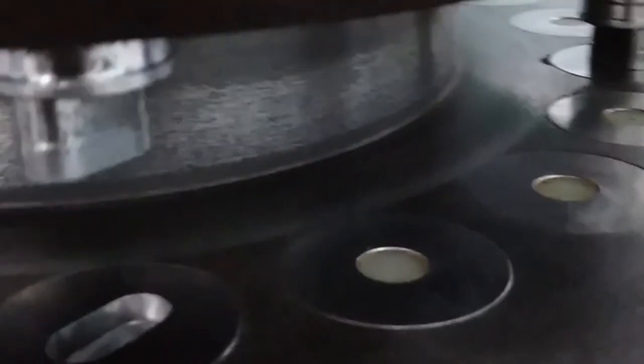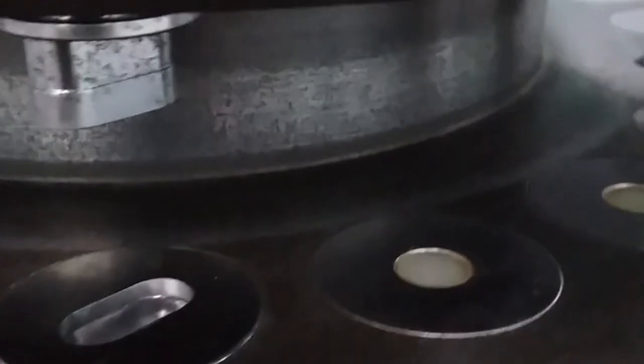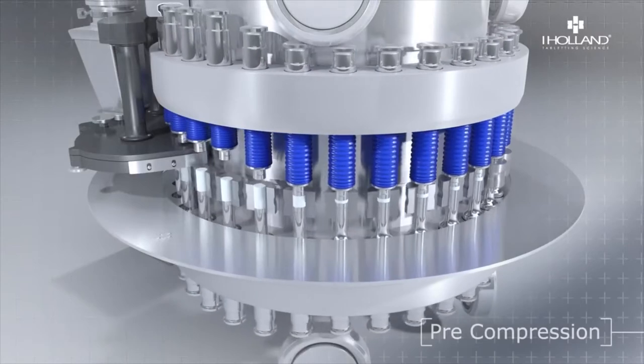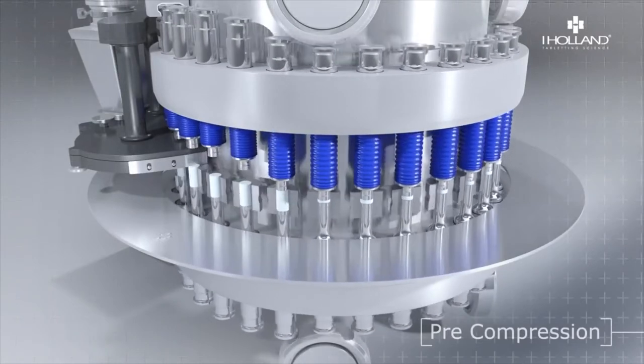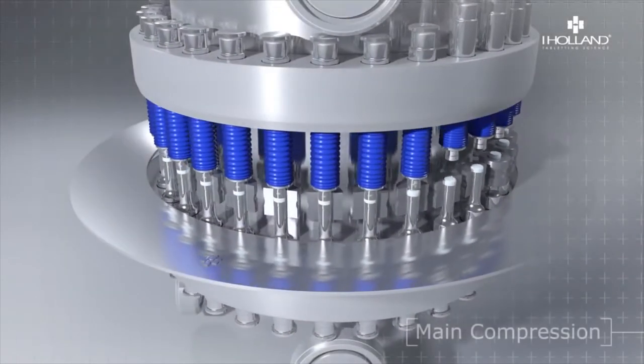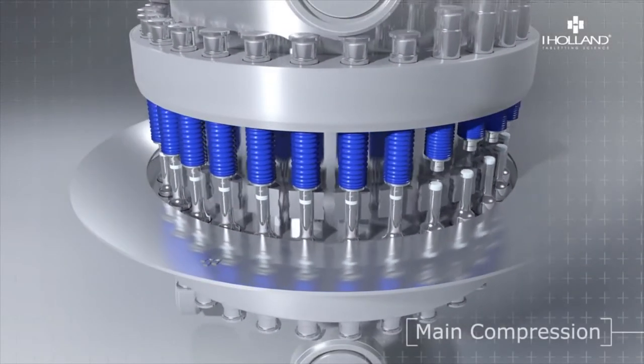The amount of gap decides the weight of the granules to be filled, which determines the weight of the tablet. After filling, we have pre-compression. In some machines there is no pre-compression — the necessity depends on the product being manufactured. In the pre-compression stage, the upper punch and the lower punch press lightly on the powder.